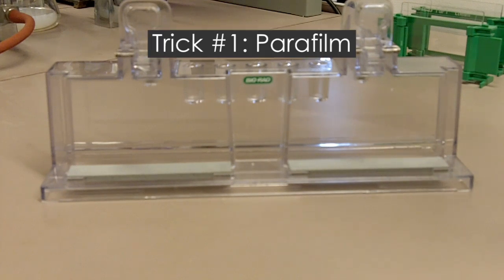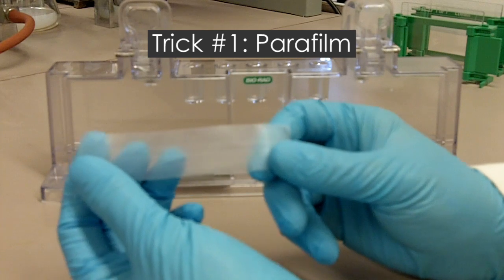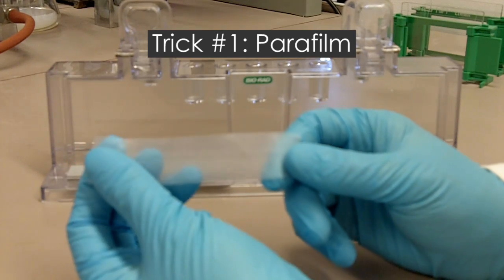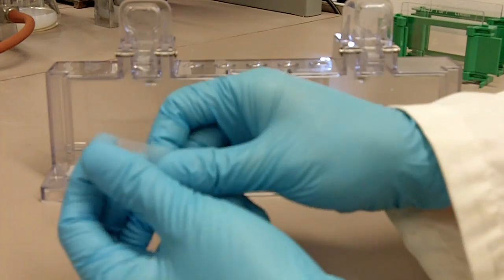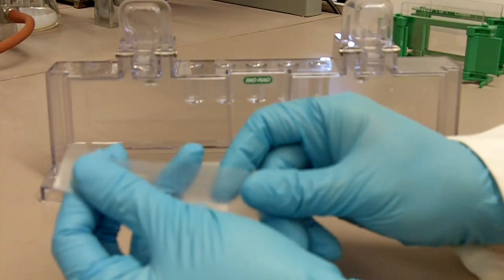Okay, so the first trick is to use the parafilm. So here I have a piece of parafilm. And right now it's too small to cover the seal. So what we have to do is we'll stretch it a little bit.